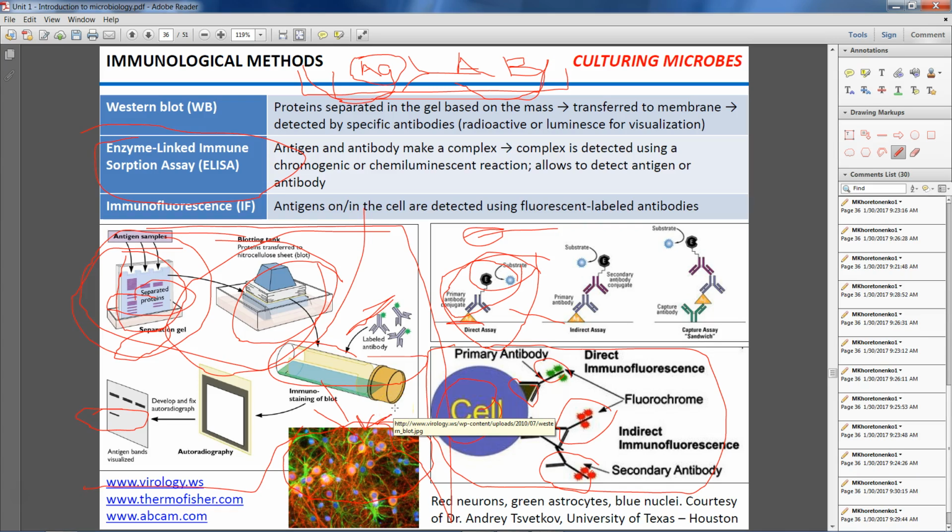You have 3 different fluorescent colors all at the same time. So you can add 3 different types of antibodies, and that will give you 3 different structures. That is convenient. You can look for 2 or 3 different antigens at the same time in the cell.